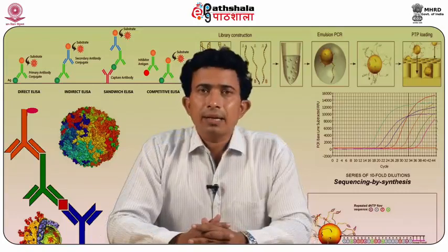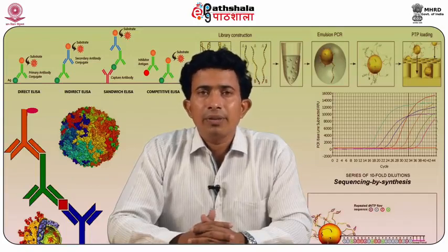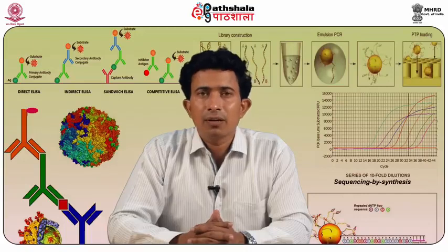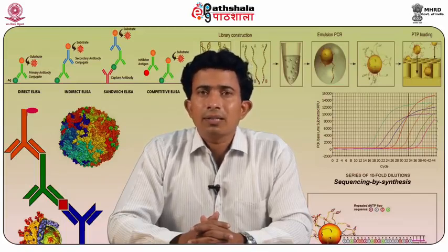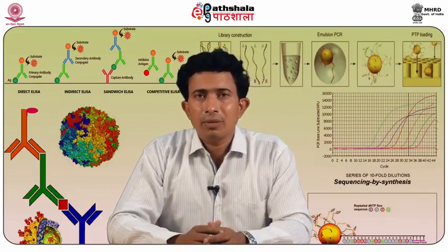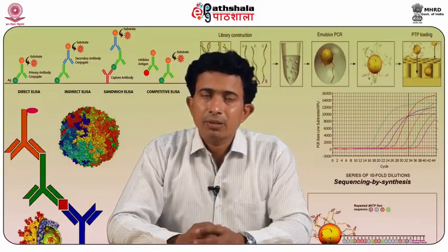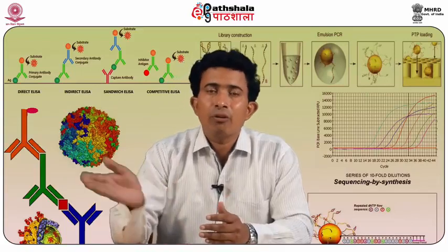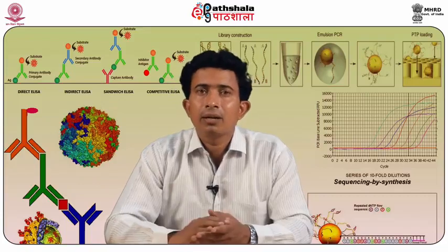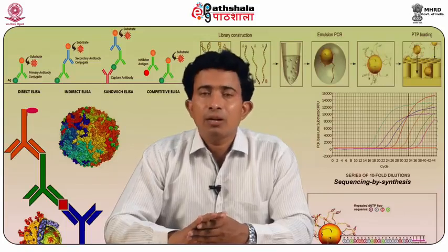There are many techniques available for DNA sequencing. With the age of development, these can be classified into three types: first, second, and third generation DNA sequencing methods. First generation includes the first and second methods, that is Sanger's Dideoxy chain termination method and Maxam and Gilbert method of DNA sequencing. These were primitive methods, suffering from certain disadvantages, and that led to the development of second generation methods that are pyrosequencing, Solexa method, SOLiD method, DNA nanoball method.